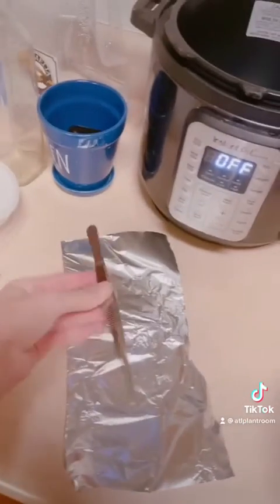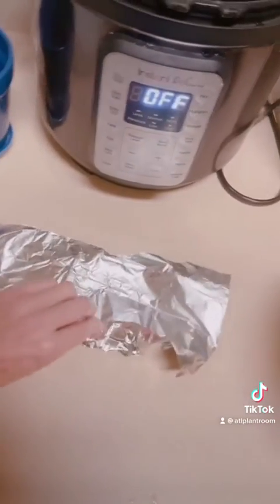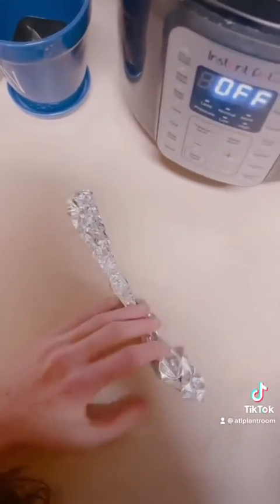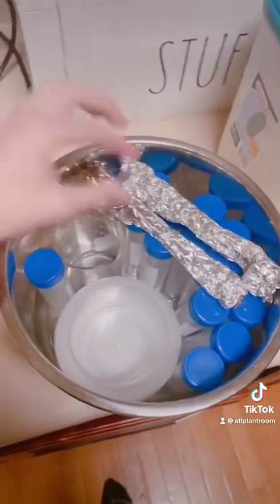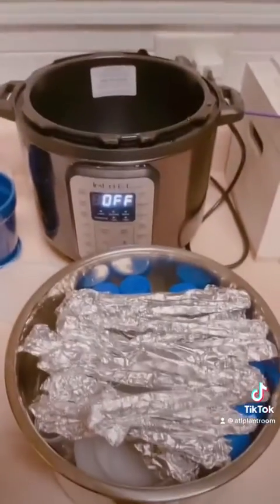For anything metal like forceps, you are going to want to put them in tinfoil. Wrap them up like this and then bend the edges over and put them on top. This is all done. Now I'm going to add water to it and put it in here.